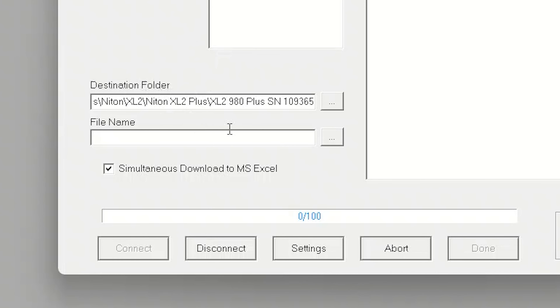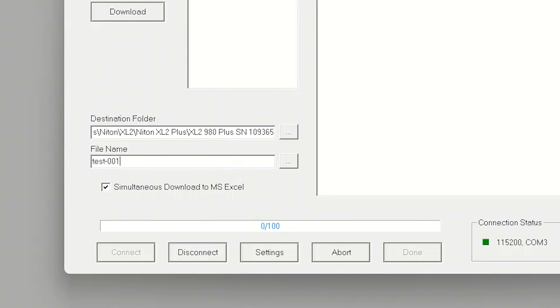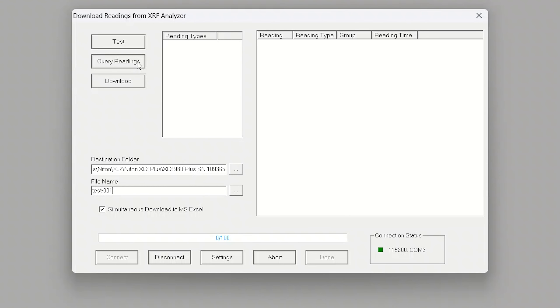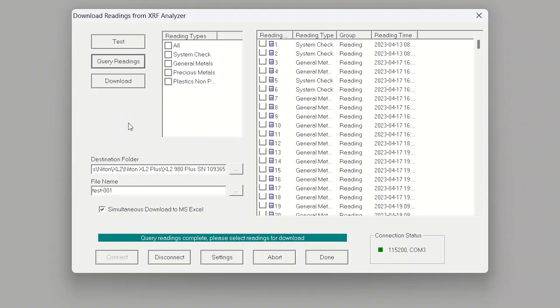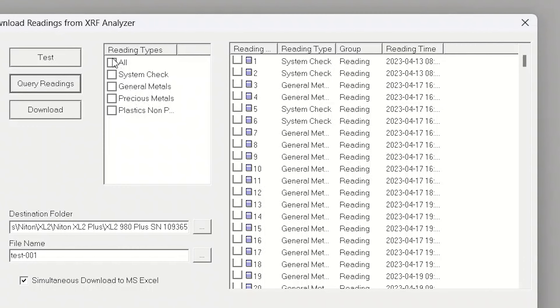Next, we're going to want to make sure to select the destination folder and set the file name. I already have the destination folder set. I'm going to name the file 'test001' and then we're going to query the readings for this analyzer, which will pull the readings in so we can tell the computer what we want to download.